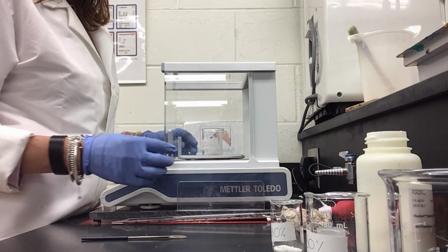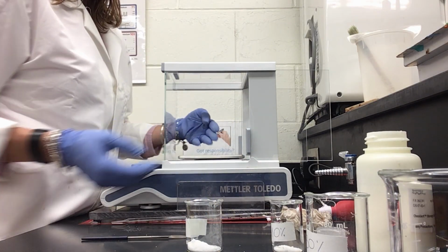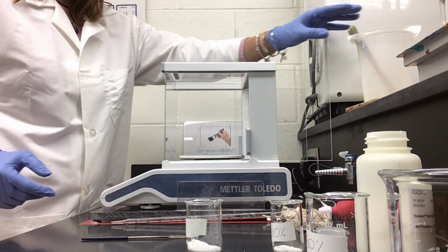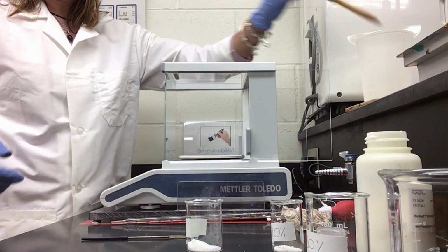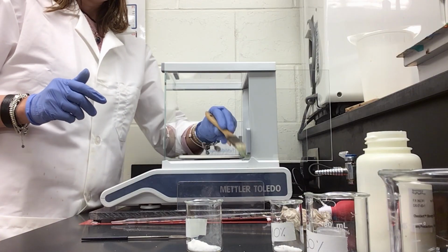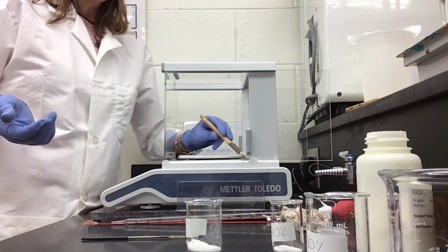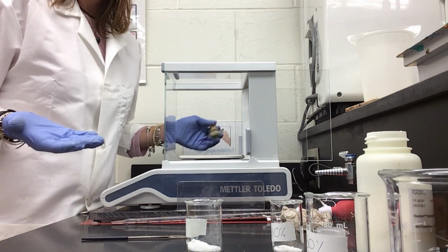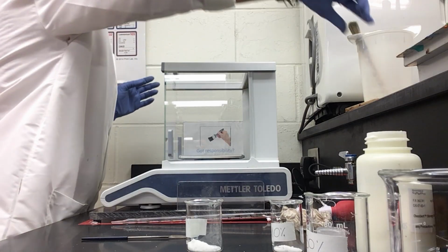3.01, that's okay. So now I can take these away. Since I noticed that I spilled some sugar on the balance, I am gonna take this brush that you will find right in front of the scale, and I am gonna clean it so that the next user, which might be you, finds the scale very, very clean and doesn't risk contamination. So once you're done, you close and you put the brush back.